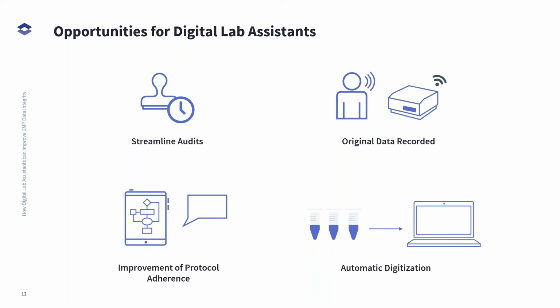So this real life situation required essentially the development of a process that would allow the documenting of these activities, which were witnessed by a second operator who would serve as a double checker. What this really means is once the operation was completed, the production operator would exit the biosafety cabinet and then document the completion of all the activities at one time.